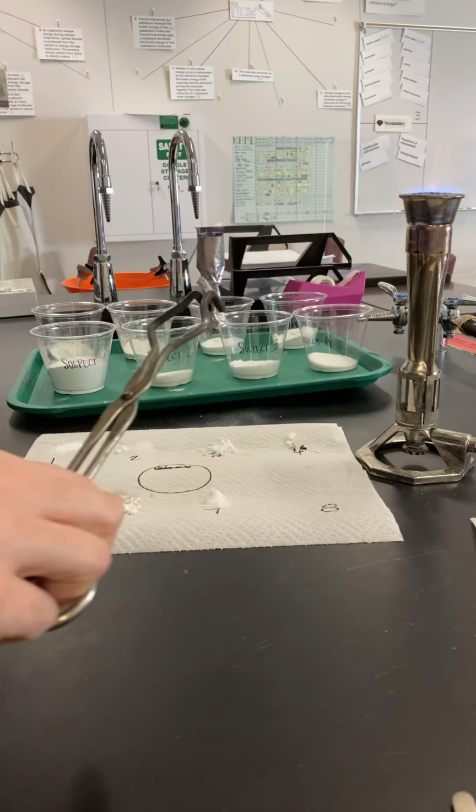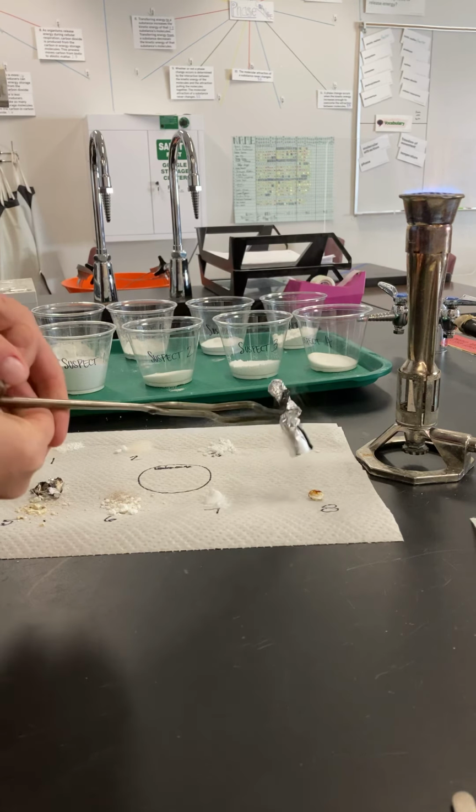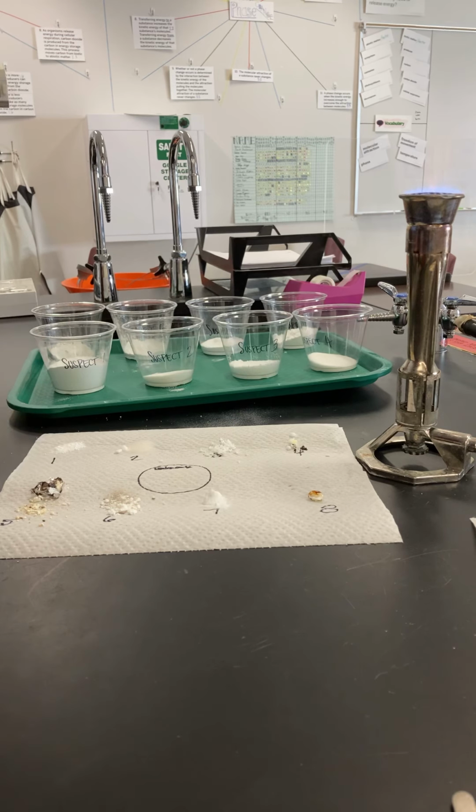Okay, 1, 2, 3. It's already started melting. 4, 5. So again, it started on fire like some of the other ones. And you guys can see kind of what it looks like there as far as how it melted. As far as that goes, it kind of has a little bit of a smell to it, almost a sweet smell, but not super strong.